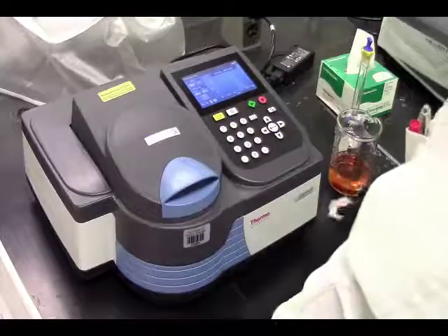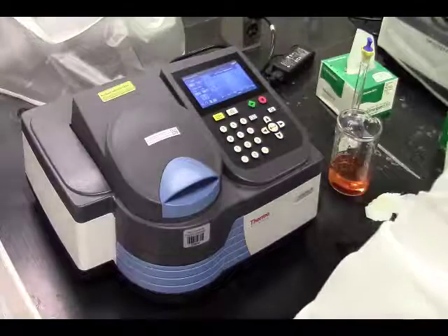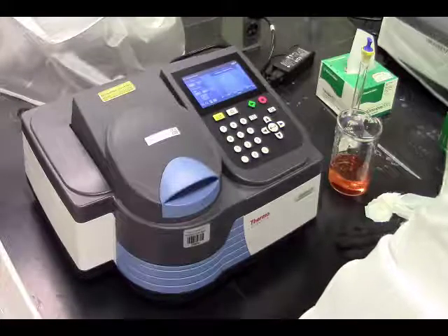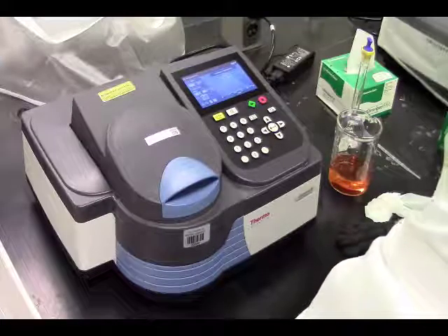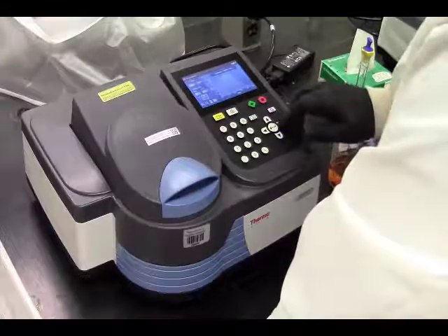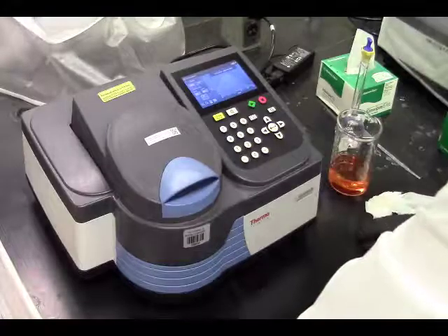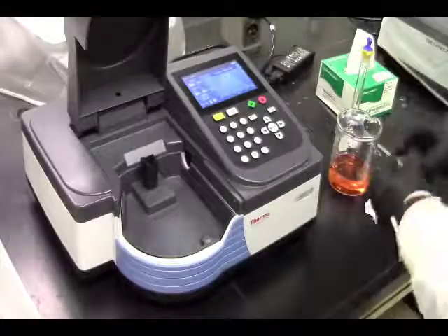This is 50. And why do we need to maintain OD units of that number, that little magic number that you need to discuss for Beer's law? Why should that absorbance or below that number be maintained? This is 1.040. I think we're going to be close enough to 1 for that to be okay.